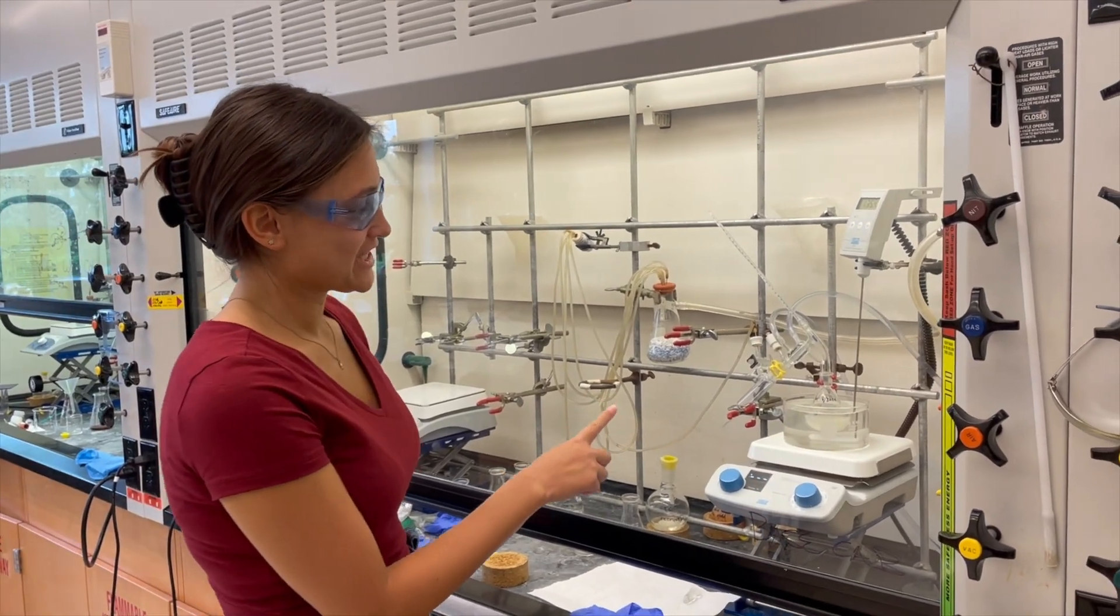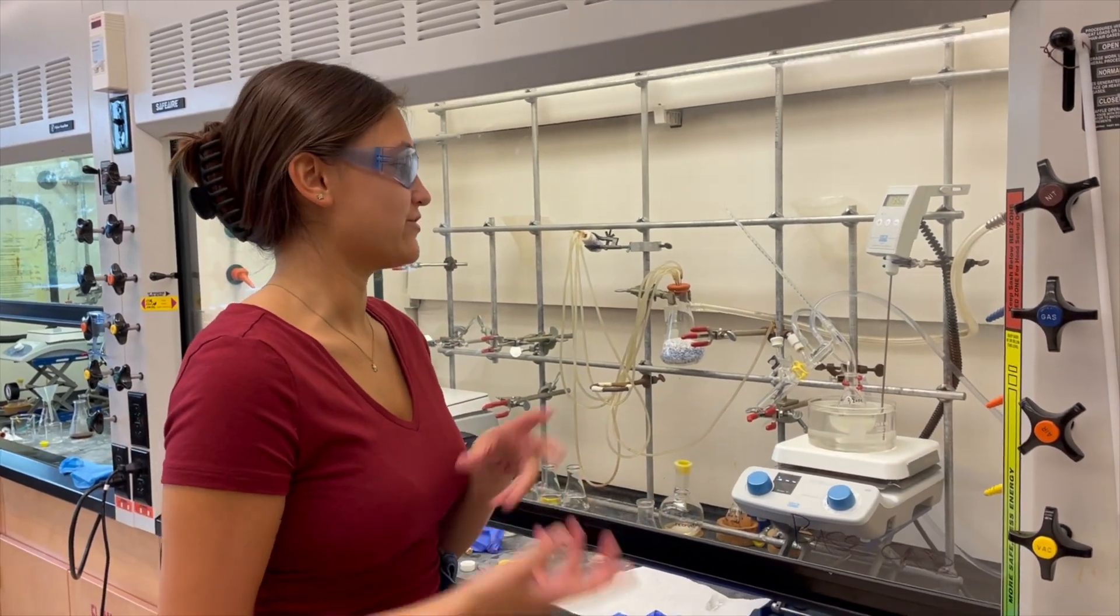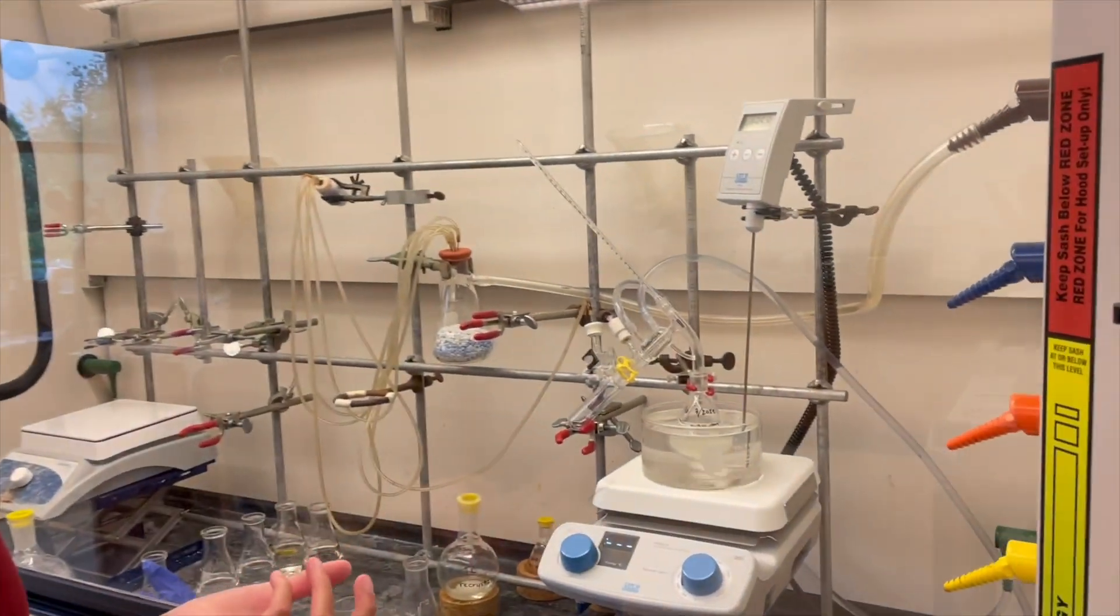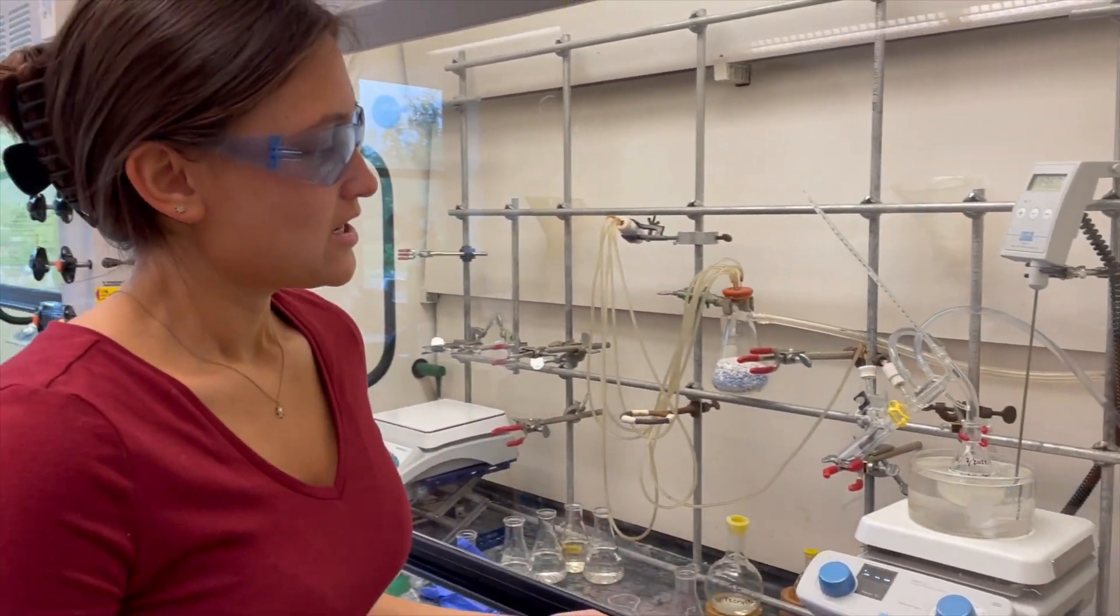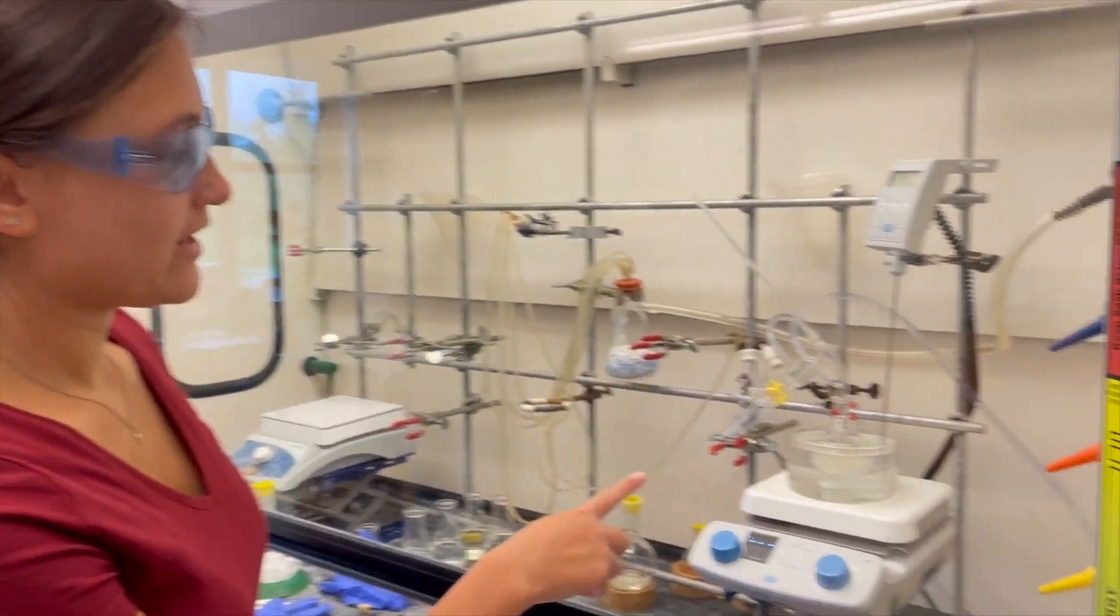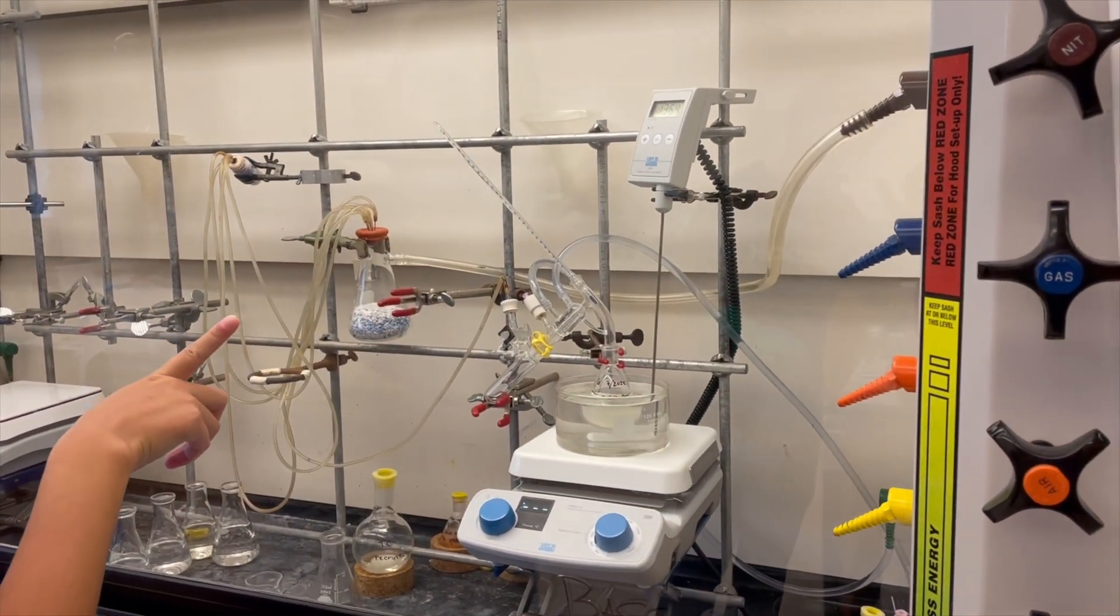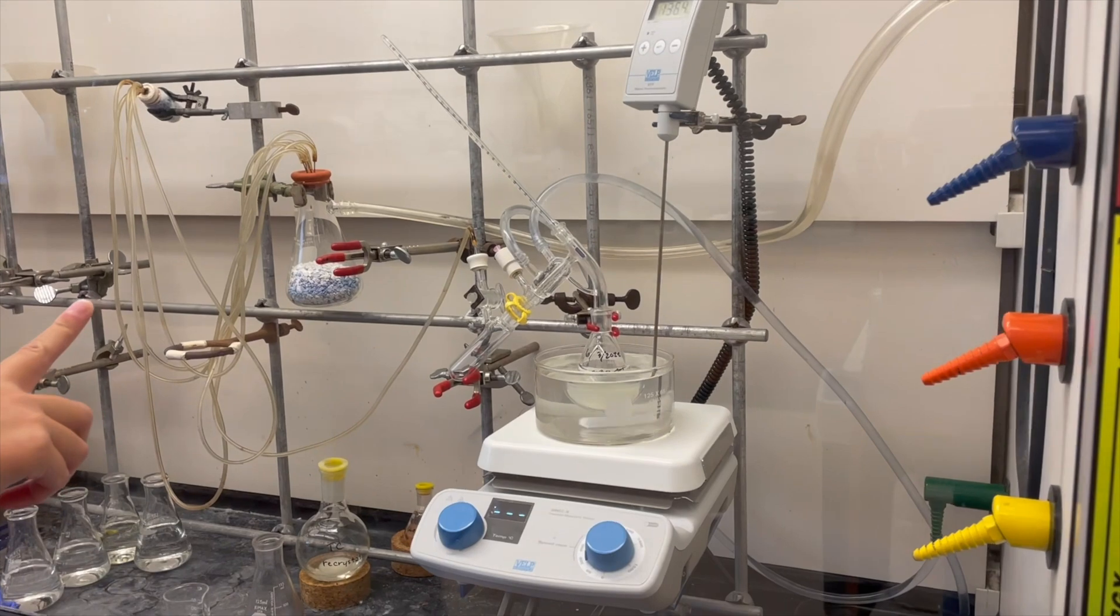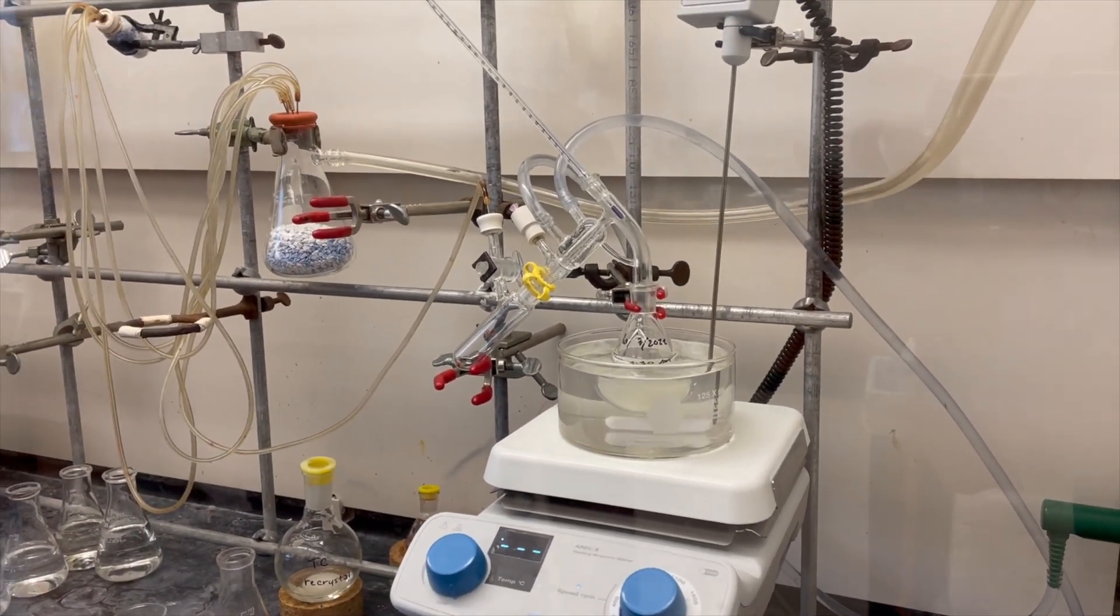Right now I'm doing a distillation. A distillation is basically where you take something that we use in lab that's kind of dirty and you distill it so that you can use a very clean version of it. So right now I'm distilling Hunig's base. The stuff that's in the oil bath right now is the dirty Hunig's base and it's basically going to move over to this glass over here and it's going to be super clean so that we can all use it. This is a base that we use on a day-to-day basis so it's important to have it be clean.